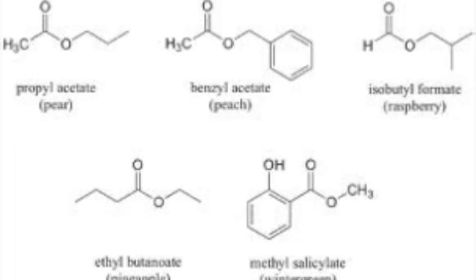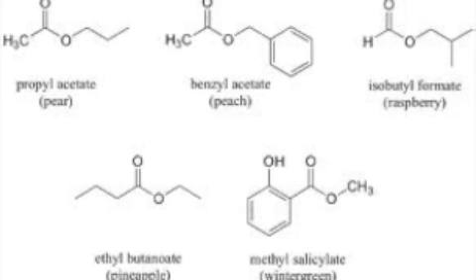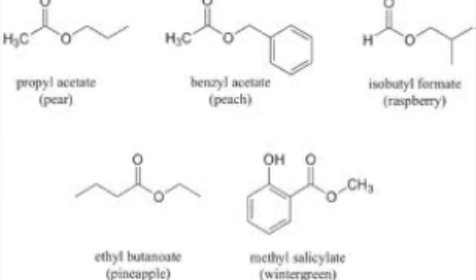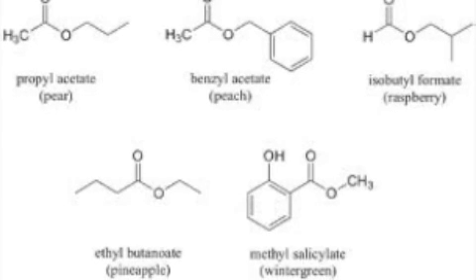From this experiment, the most important thing we learned was that different alcohols and acids can produce specific smells according to the number of carbons. However, we learned that the number of carbons does not affect the distance the scent travels.